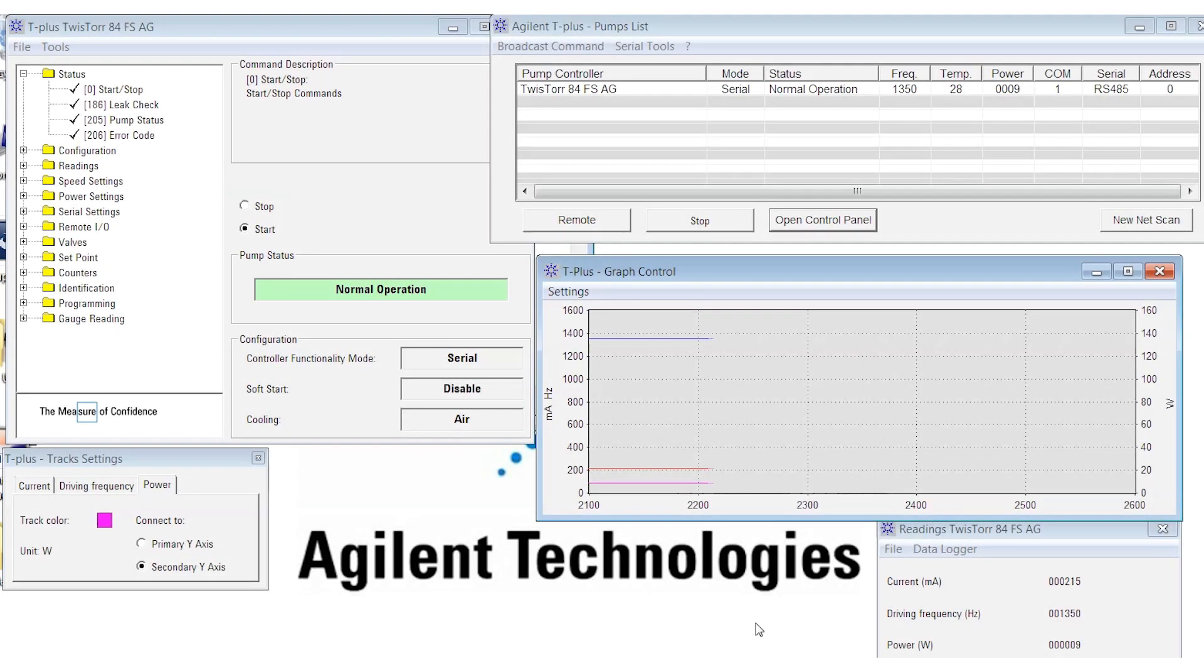Okay, so now we can see in real time what's happening to the pump in terms of power, current, and temperature.